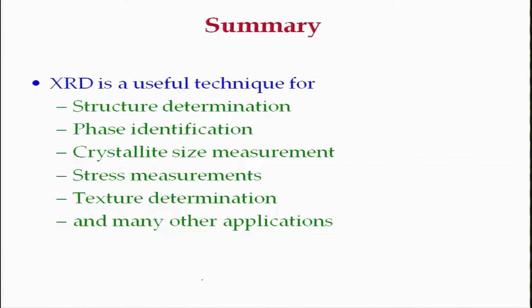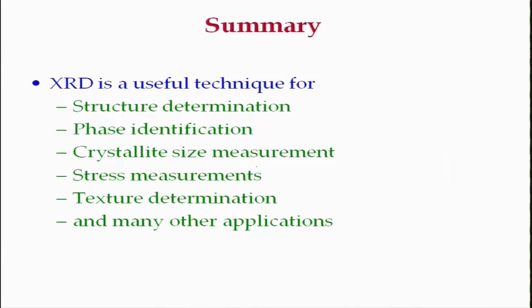So, basically X-ray diffraction is a useful technique for structure determination and phase identification, which I have not done. Phase identification is done by peak matching, okay, with respect to standard files, and you can also use a lot of software for this. It can also do crystallite size measurement, you can do strain and stress measurement, texture determination, and many other advanced applications, for which you need advanced understanding of X-ray diffraction, okay.